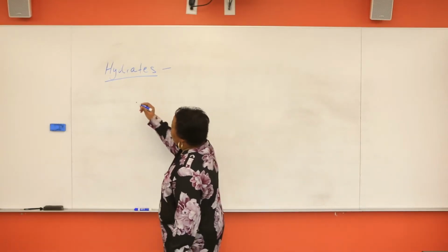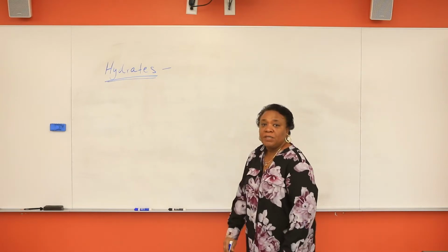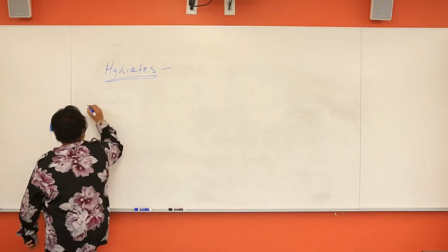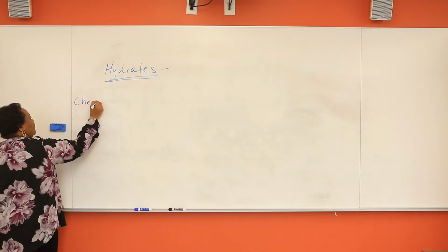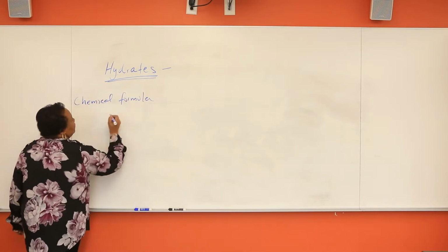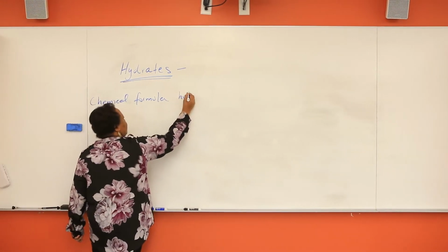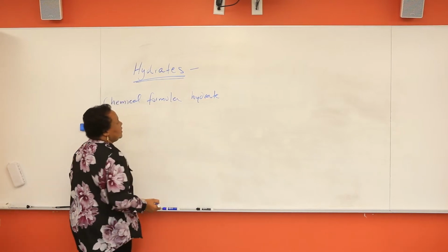For today, we're going to be running an experiment. And the goal here will be to determine the chemical formula of a given hydrate. So our goal is to determine the chemical formula of a given hydrate.